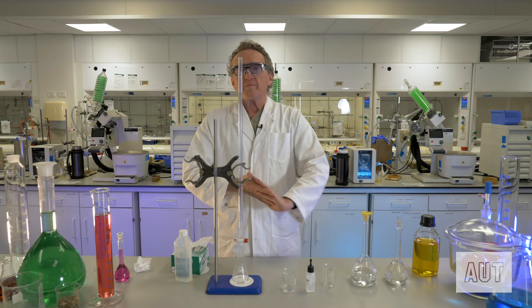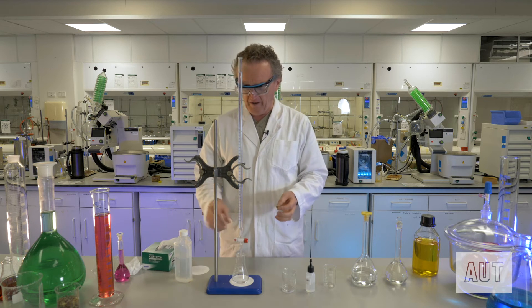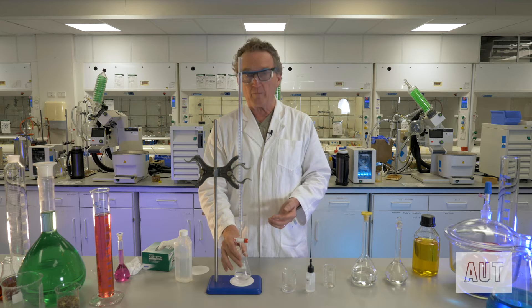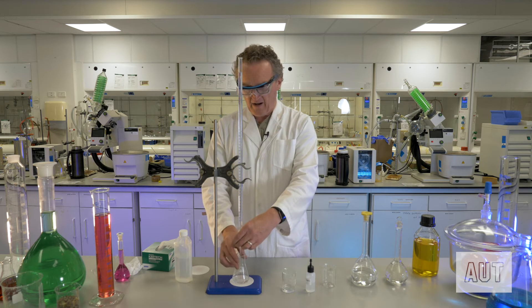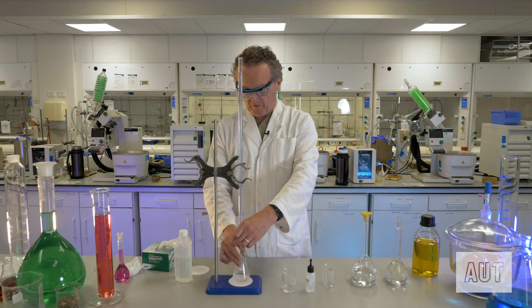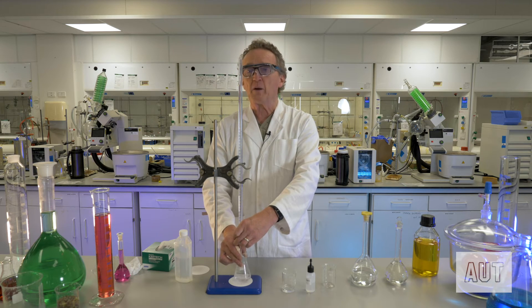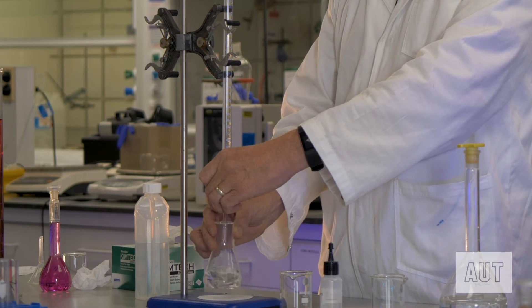Now for technique. People have different techniques for how they do a titration. I'm right-handed, so I swirl the Erlenmeyer with my right hand and operate the burette tap with my left hand, wrapping it around the tap. I find you get a lot of control that way. We're on the zero line, swirling away, and we go. You can start off relatively quickly because you may have a fair idea of what your final titration volume is going to be, so you can fairly whiz through the first part of the titration.